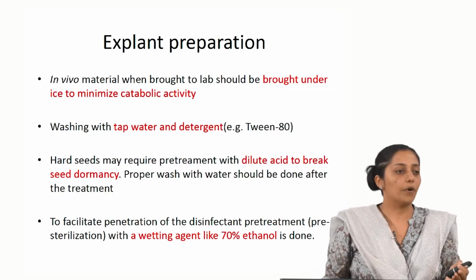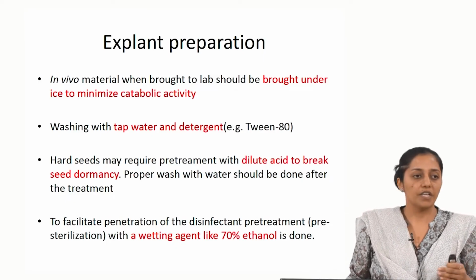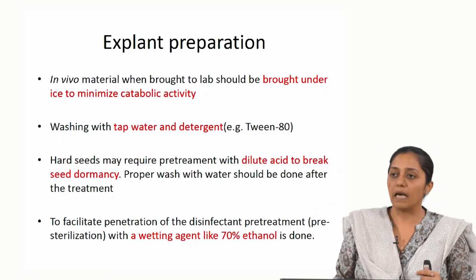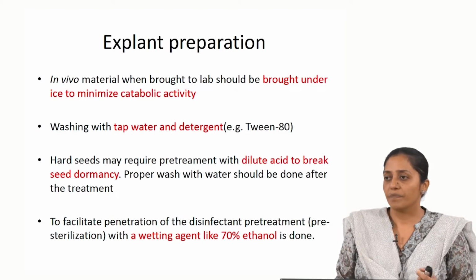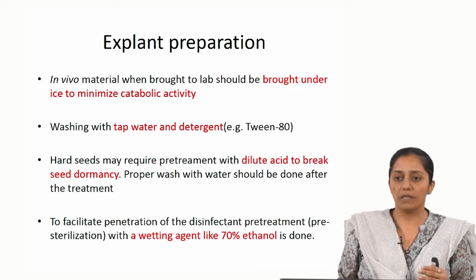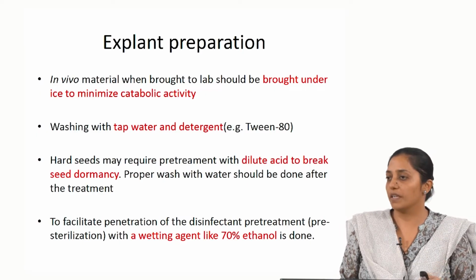Yeah, one more point. When you are using seeds as explants to generate either in vitro seedlings or any forms of cultures, sometimes, which we observed in the lab also for Viola odorata, one of the medicinal plants, the seeds were not able to give rise to the plants, despite the fact that whatever was given in the literature was being provided as the medium for germination.